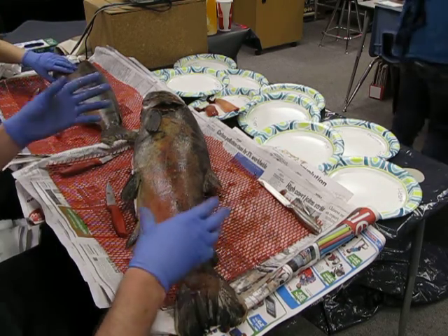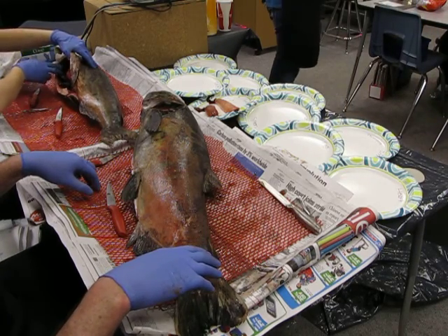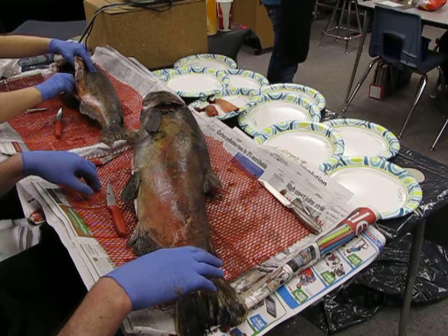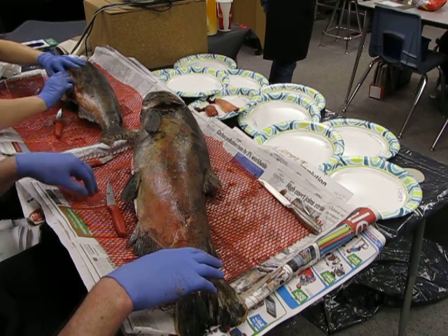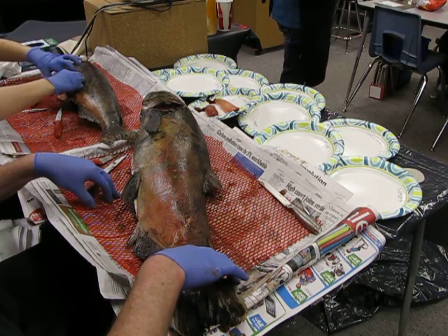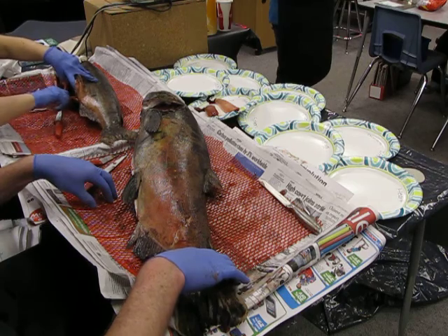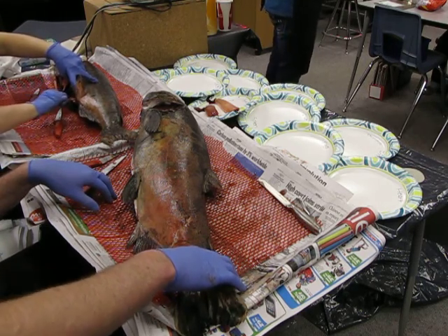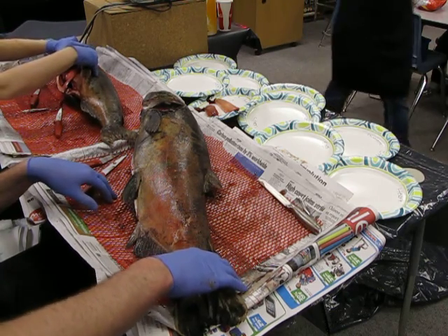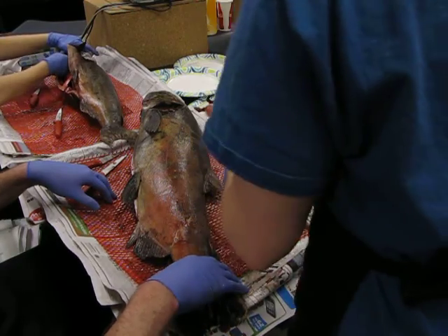If you ever go fishing for salmon and you catch one that has an adipose fin, I think of that as the adios fin. Because you can't keep it. You cannot catch wild salmon legally. You have to throw them back in the water because we want them to make it back home to lay their eggs. So the adipose fin, I think of it as the adios fin. If they don't have an adipose fin, then you can catch them and take them home and grill them. Make some salmon steak fillets out of them. It's true. So let's look at the fins on the bottom of this fish.